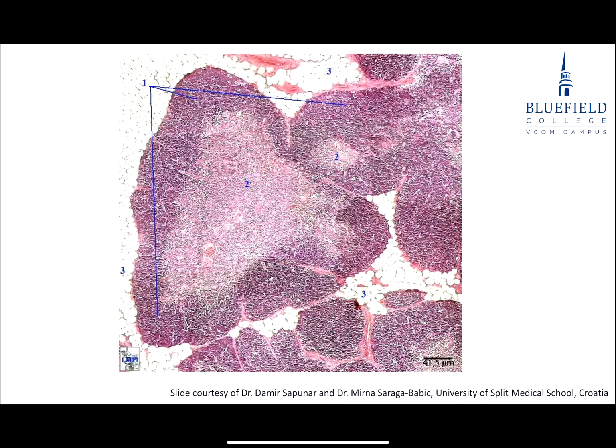If I want to look at that and say, is that a lymph node with a cortex and medulla? I don't see nodules in here, do I? I'm always going to see nodules. The capsule looks different. In fact, I've got adipose. That's just saying this is a 20-year-old. This might be your thymus or maybe a teenager's thymus, let's say, where it started to involute, but it still has a good bit of the structure to it.